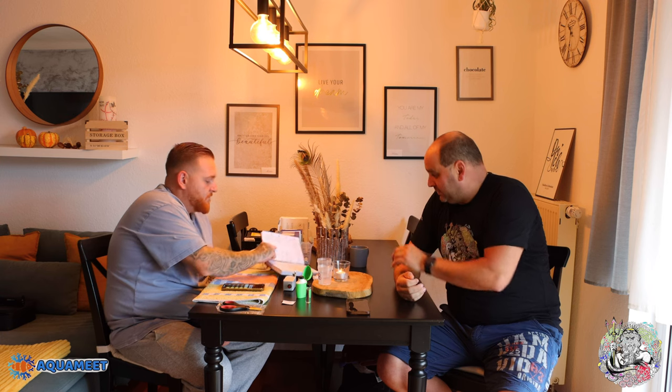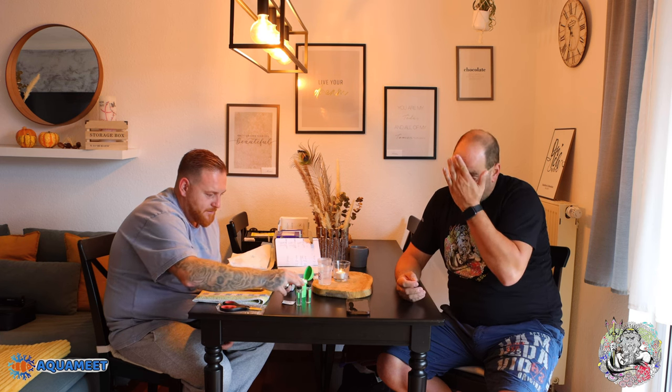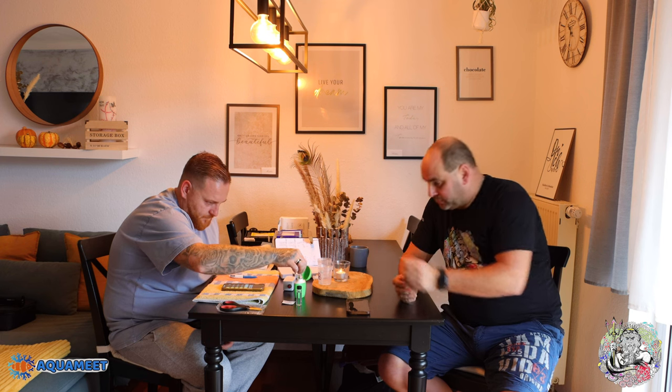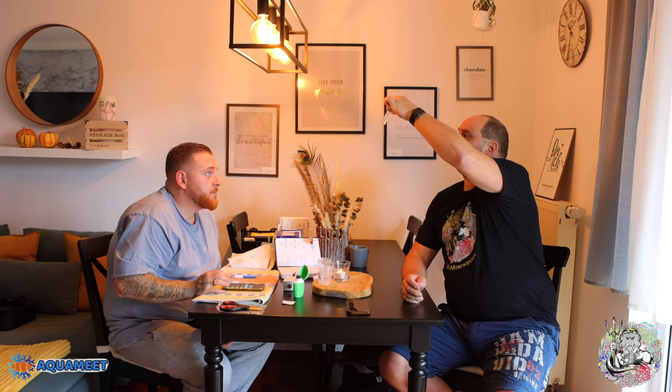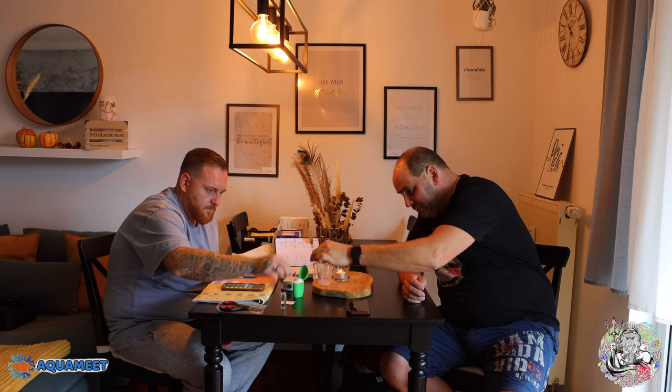Jetzt bei 0,052 – also bei 17 – und gestern nicht dosiert. Das ist runtergegangen von der 0,08 auf die 0,052. Das heißt, es wurde was verbraucht, aber wer da was verbraucht hat, wissen wir jetzt tatsächlich nicht. Gut, ist notiert. Dann machen wir jetzt mal ein Schnellverfahren und gucken, was dabei rauskommt.